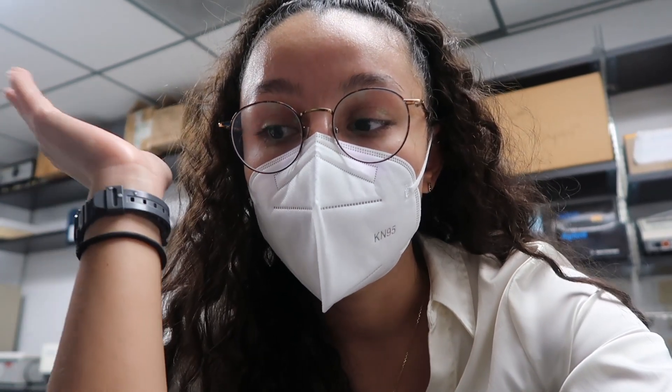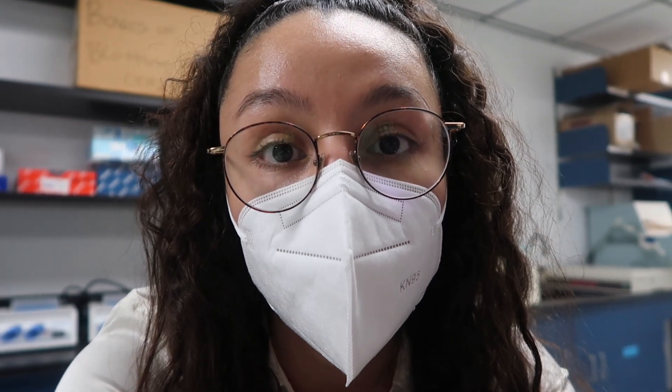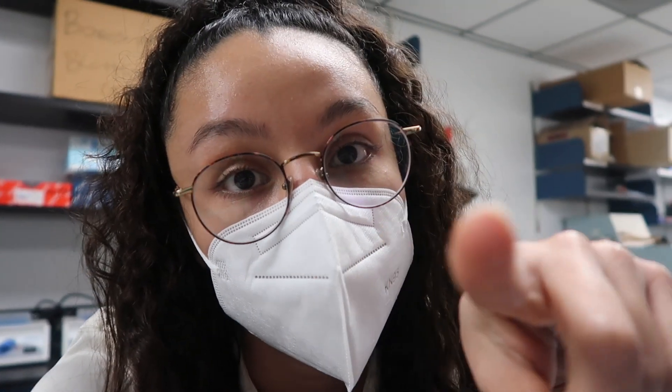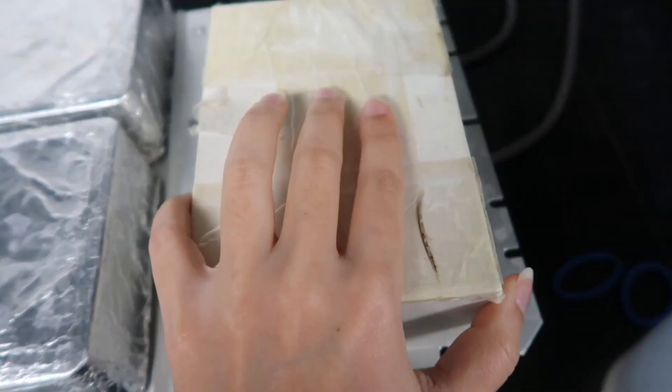Oh my god, I just messed up so bad. But I talked to my lab mates about it and they gave me advice and told me that it happens to everyone. Update on my total screw up: we looked under the microscope and it appears that everything is okay. We're just letting it sit in PBS and let the Triton soak off, and then I'm gonna remount without making mistakes this time and check again. So far it's looking like it's okay. Here they are soaking in their bath to get rid of the Triton.